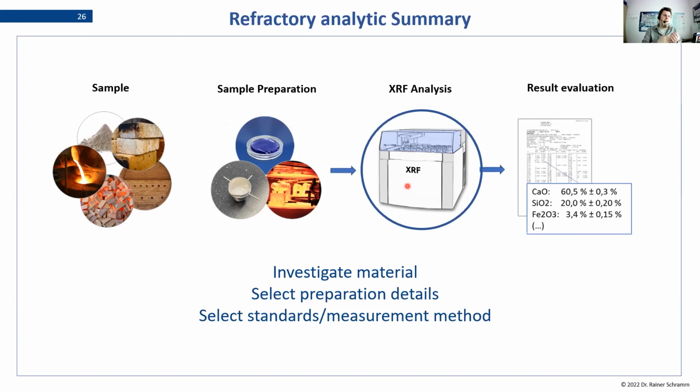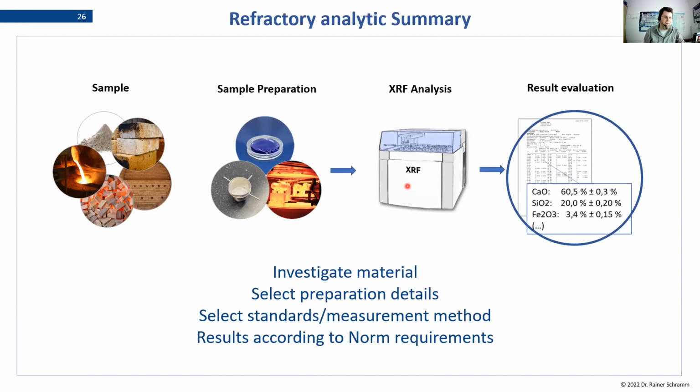And then analysis wise, we have to choose which are the analytes of interest for our analysis, but we also need to think about the contaminations from sample prep on additives, and to make sure that we get all the information that we can calibrate later. And yeah, the final results should be a results evaluation or an analysis that gives you reliable and repeatable measurements, maybe even norm according. That's up to you, but definitely the best result possible for your material and your refractory.